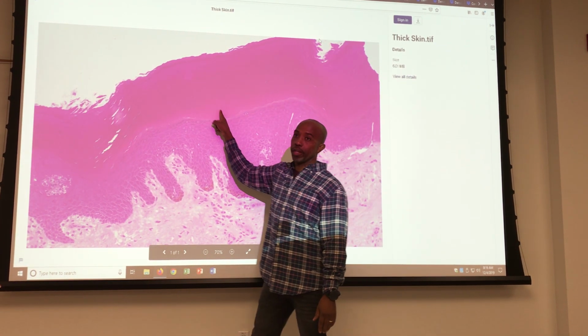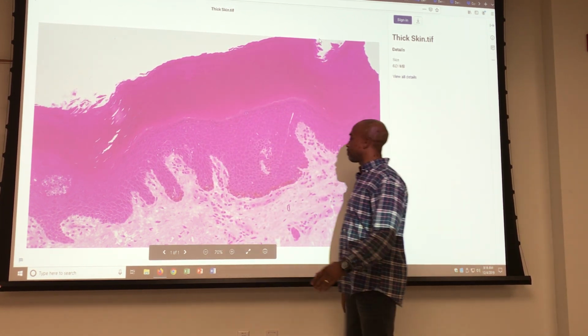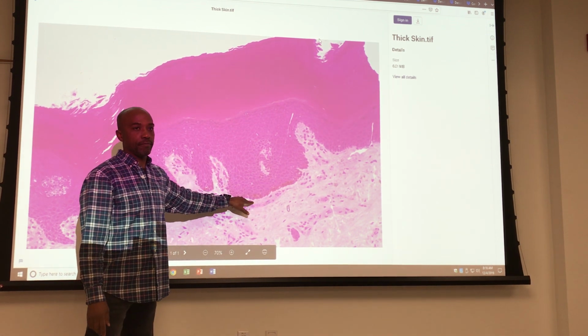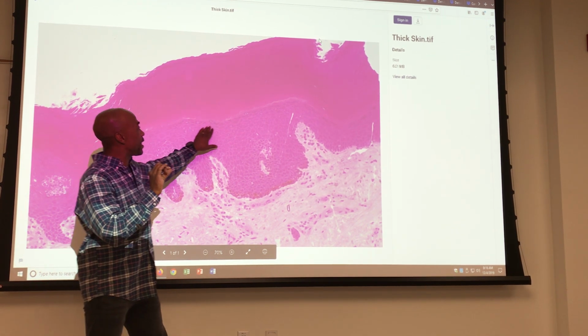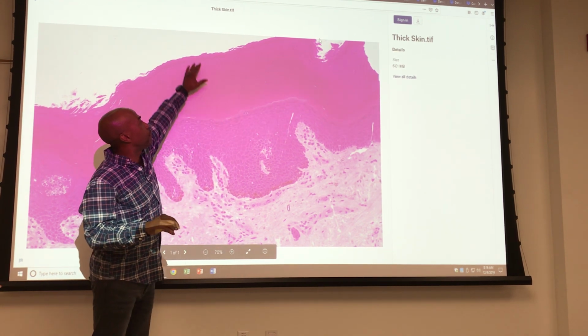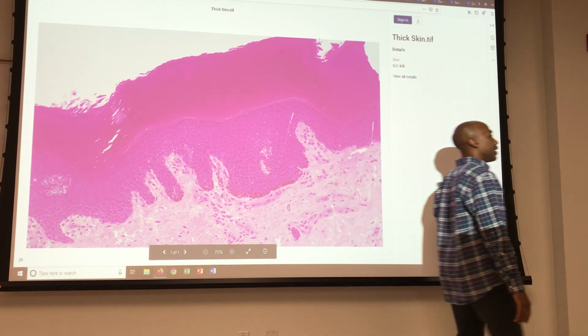And then this thick part is corneum. So five strata. Again, basale or germinativum, spinosum. The granulosum layer is always slightly darkly stained. The light part is lucidum, and above it, this thick part is corneum. Thick skin. Here are soles of the feet.